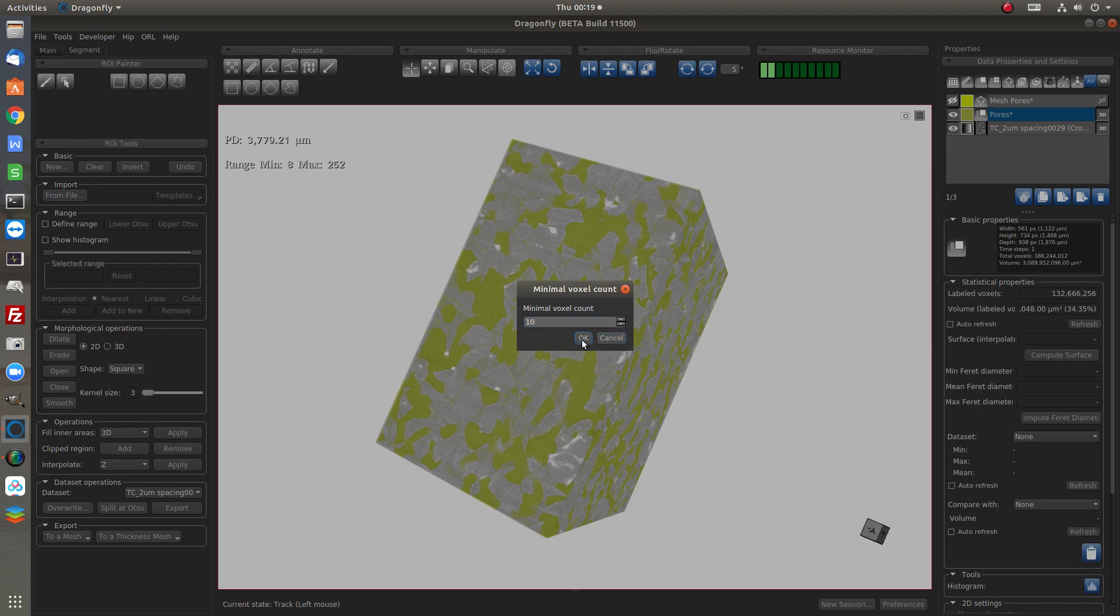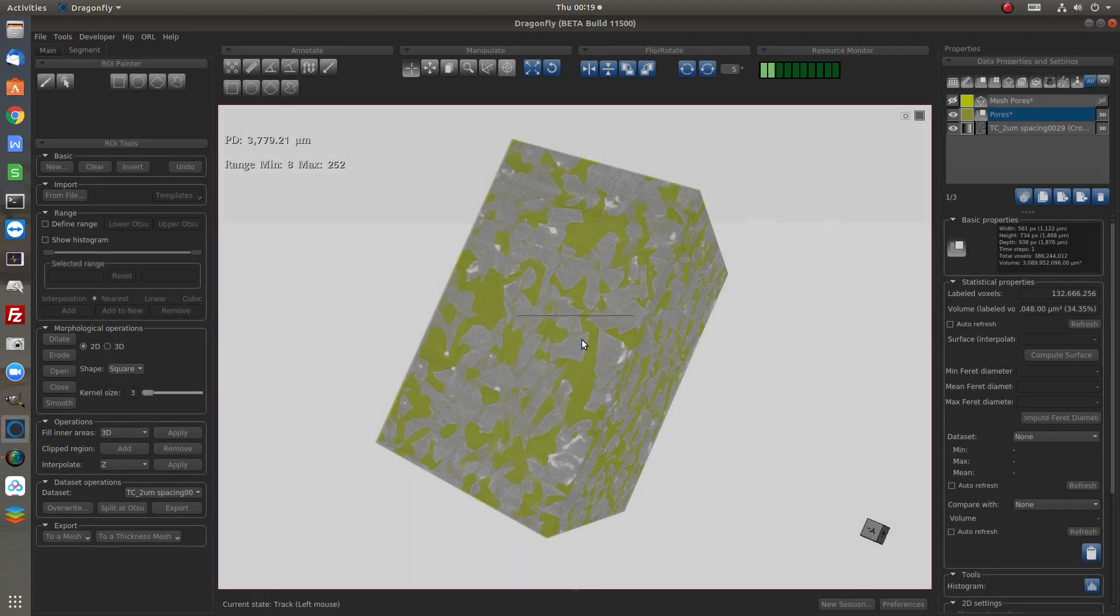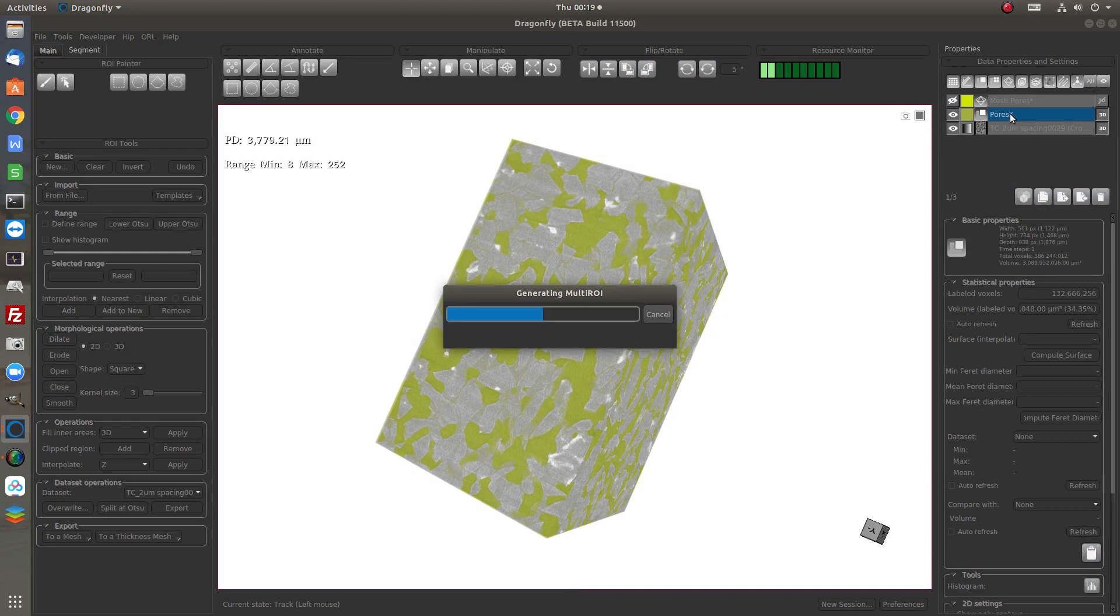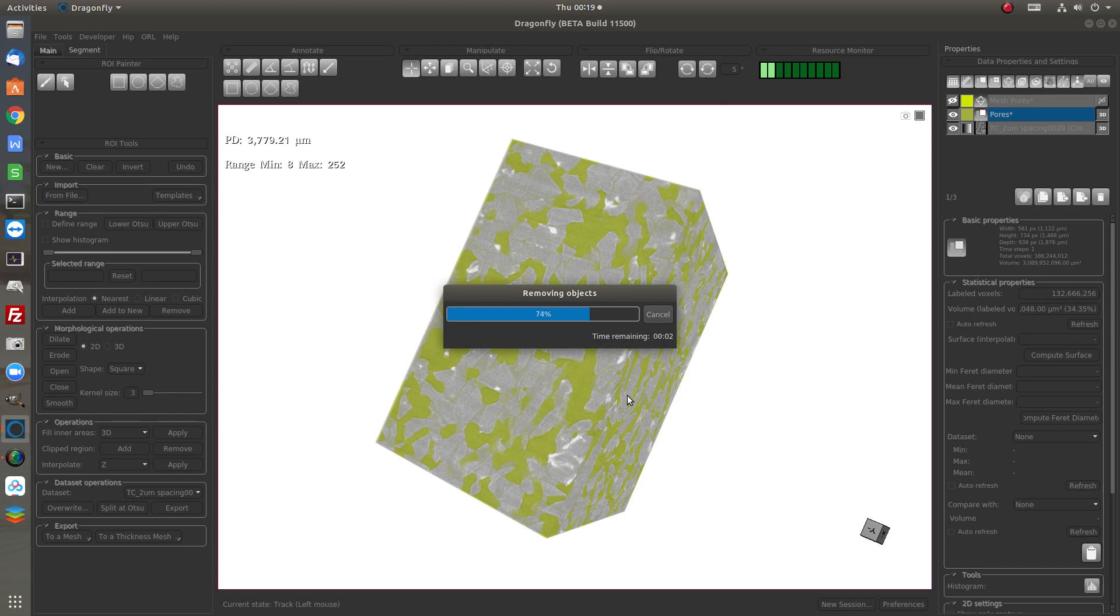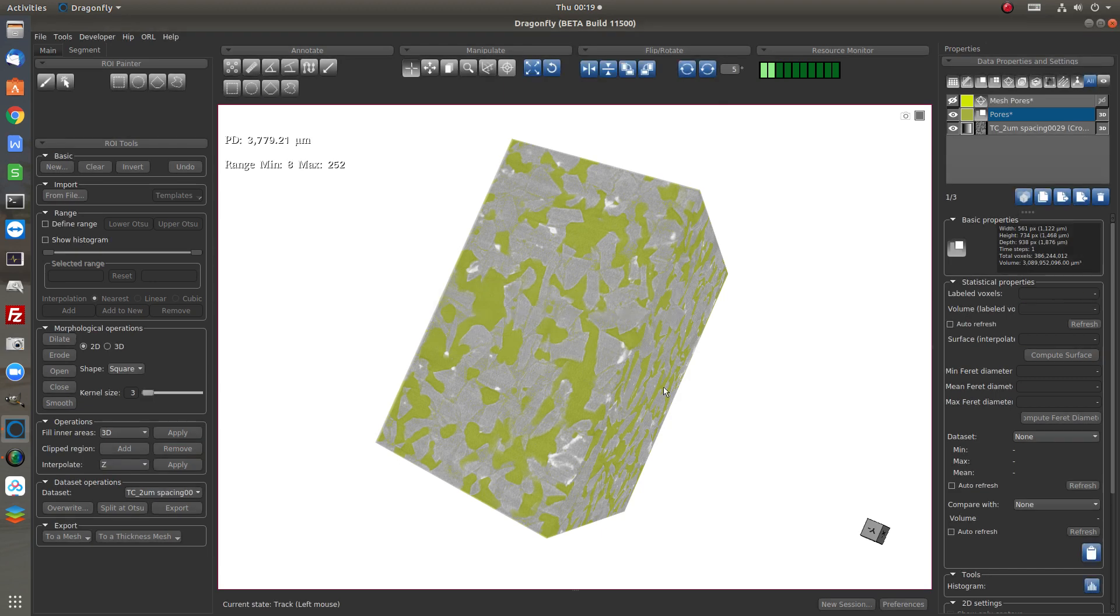So we could do this to refine the ROI before we create the mesh. Then we can remove all the very tiny pores if we want.